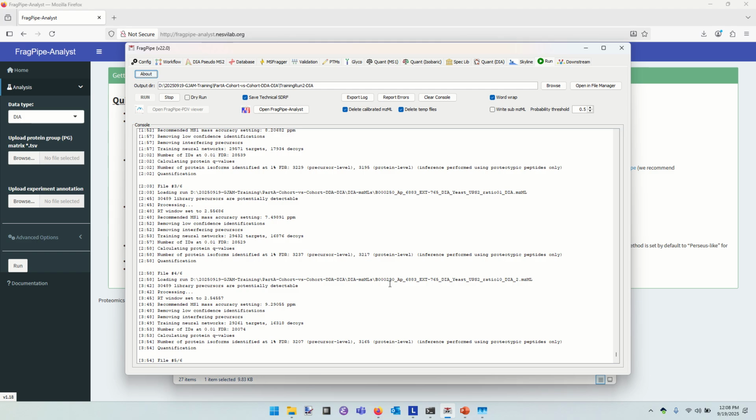13.9 minutes, but I'm cheating. 13.9 minutes. I dumped it on the new processing unit. Yes. Over in the basement. That seemed a little bit. Running this on a desktop is a very different experience. Running it on a server with 128 cores is a little bit different.